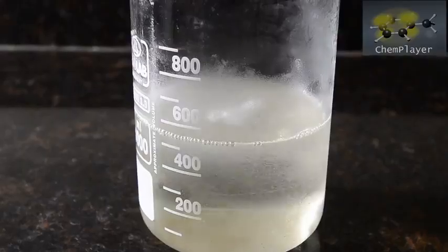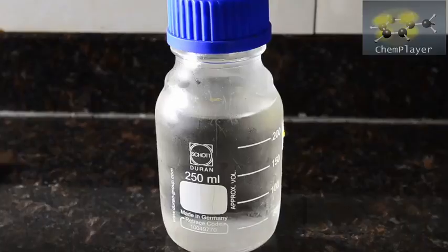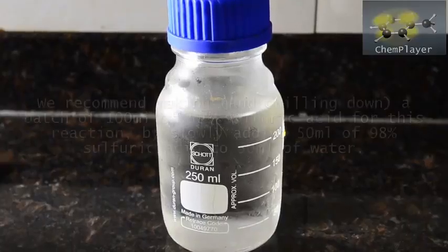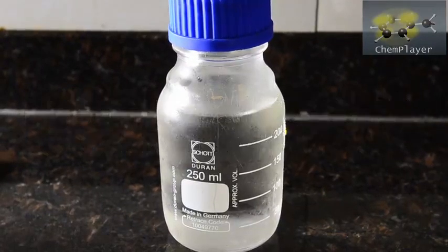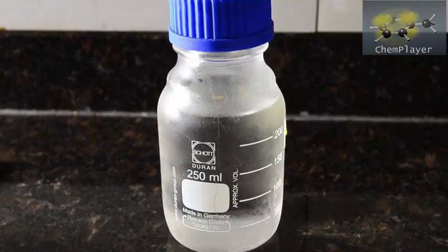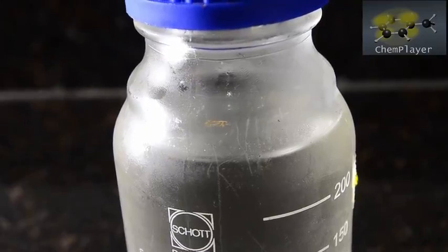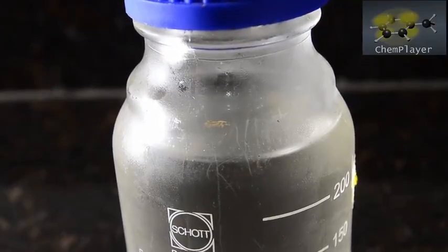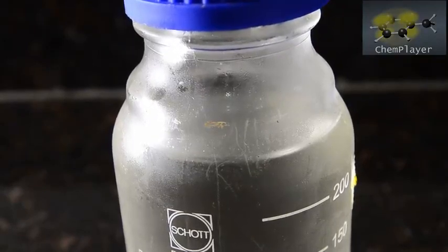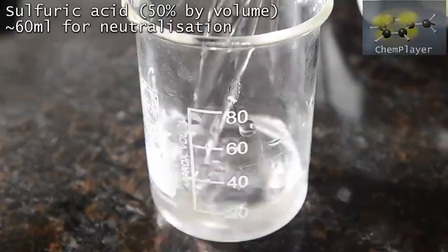Here's our reaction mixture chilled down to just a few degrees C. For the next step we're going to need lots of 50% sulfuric acid in water — that's 50% concentrated by volume. Make up a batch of about 100 ml using 50 ml of water and carefully adding 50 ml of concentrated sulfuric acid. The temperature will go above 100 degrees C, so take care. Then chill the resulting liquid in the freezer until it's at 0 degrees C. You'll need about 60 ml of acid for this first step.